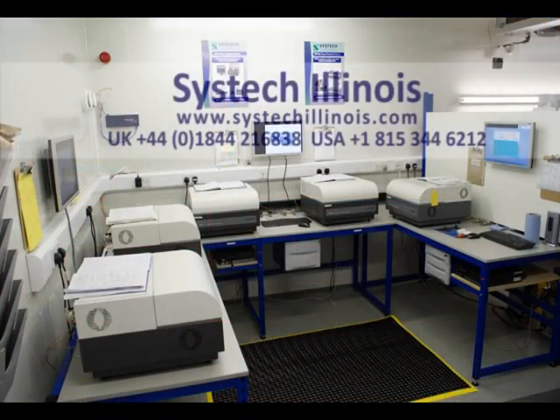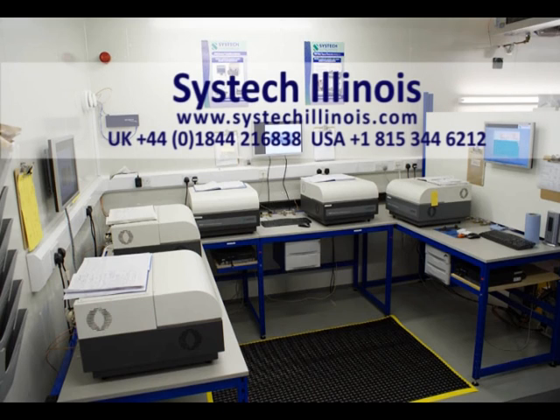Well that concludes our brief overview of the Systech Illinois 7001 Water Vapour Permeation Analyzer. Please see our website or contact us direct for further details.